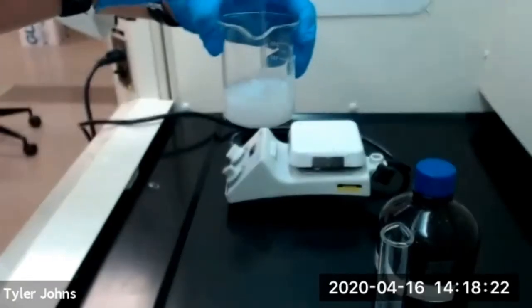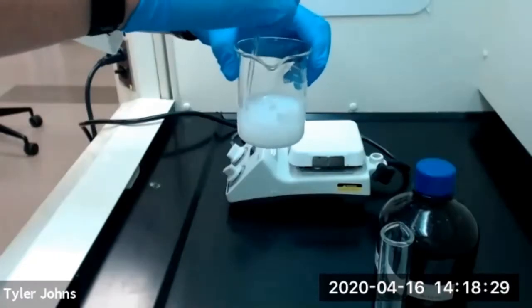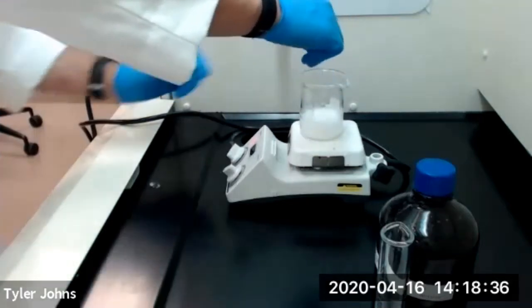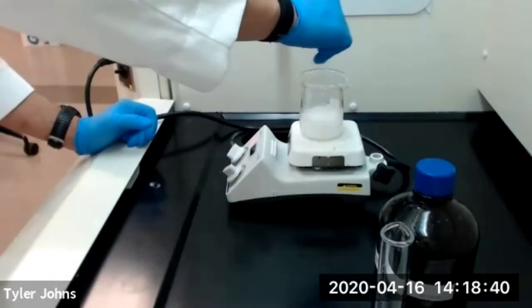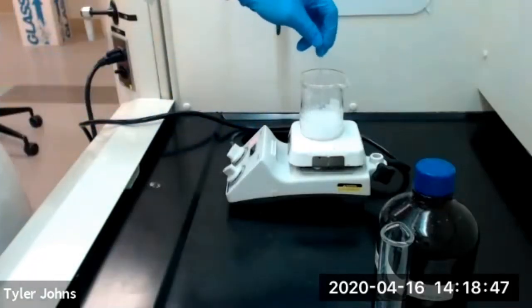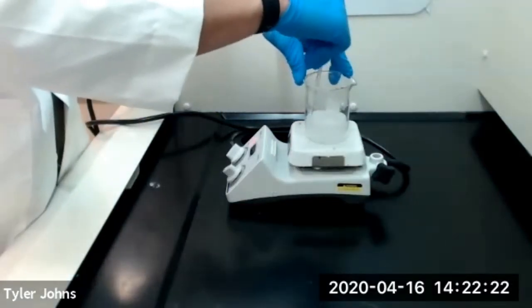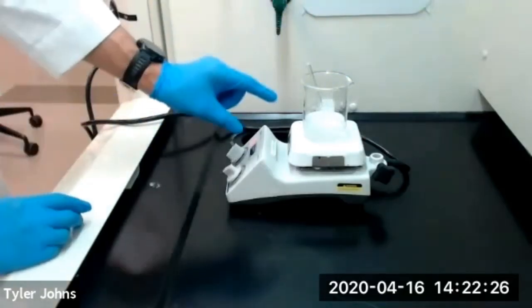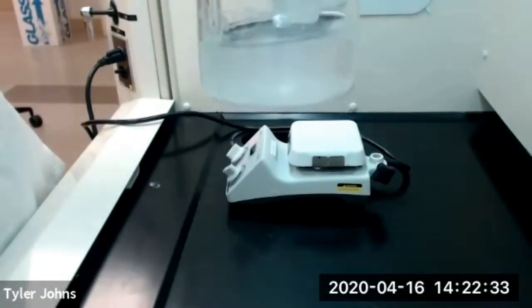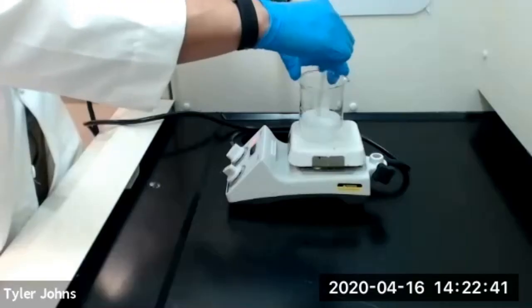What we're going to do next is we're going to gently heat our beaker until we reduce our volume to about 45 milliliters. I'm going to put this on the hot plate. Continue to stir. We're going to heat this gently until we reduce our volume to 45 milliliters. So we're continuing to heat and reduce our total volume down to about 45 milliliters. But as you can see, most of our aluminum hydroxide lumps have now dissolved and our solution is turning clear. So we'll continue heating this gently and reducing the volume.